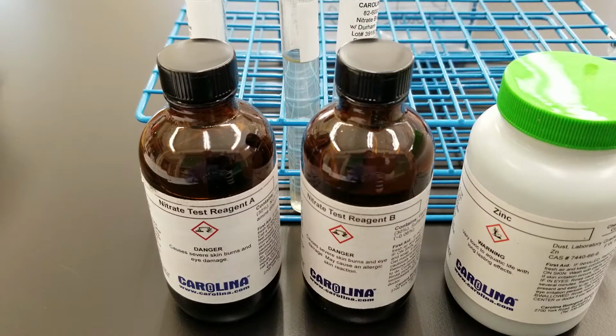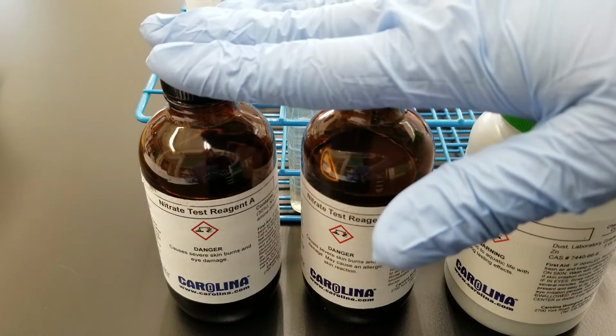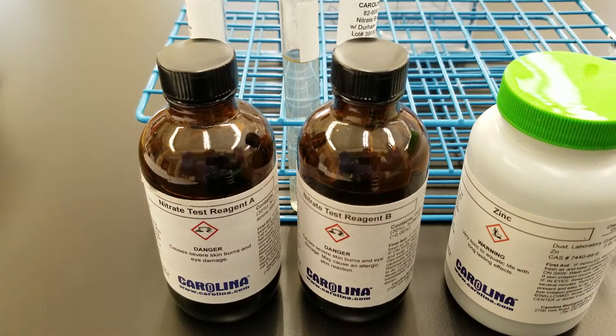And when you end up putting this in with that diazonium salt that was made from the reagent and the nitrite, if it was present, you end up making a red water-soluble azo dye. Okay, so if the nitrate was reduced to nitrite and both of these reagents were added, if that was the case, it turns red.